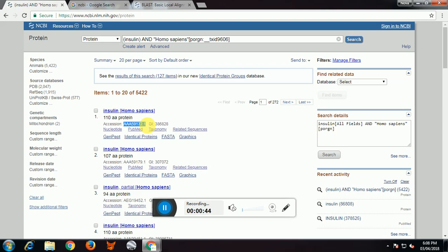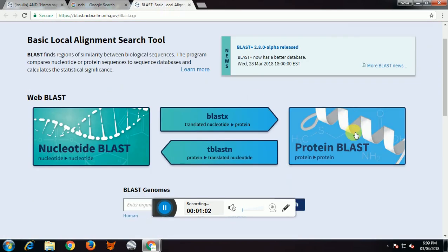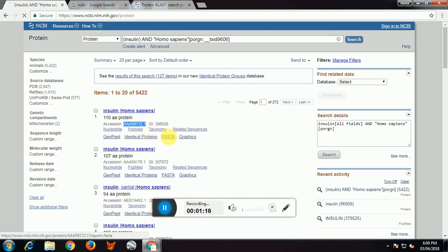We have kept insulin as an example in the majority of our videos. Just go to protein and then type 'insulin Homo sapiens'. We are going to select the first sequence as the result, which is the accession number highlighted over there. That particular sequence we will be taking for protein BLAST, so I will copy-paste that accession number and go to the BLAST page.